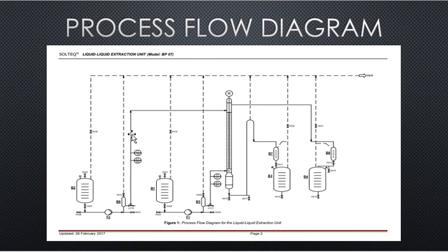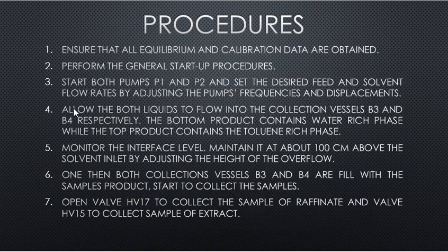The next part is the procedures. The first one, we have to ensure that all equilibrium and calibration data are obtained. The second, we have to perform the general startup procedures first.